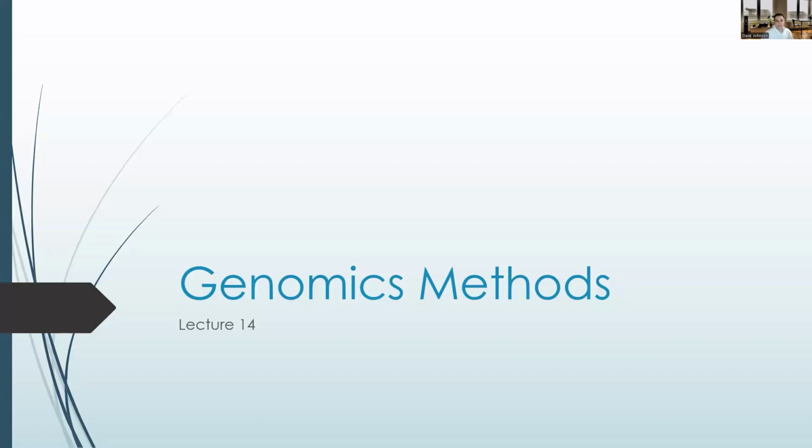So in one of my previous videos, I talked about what genomics is. I kind of introduced all the omics actually in one of my previous videos. In this video, I'm going to talk about some specific techniques that are used in the field of genomics.